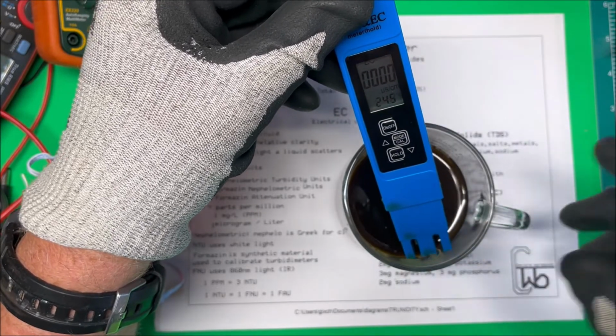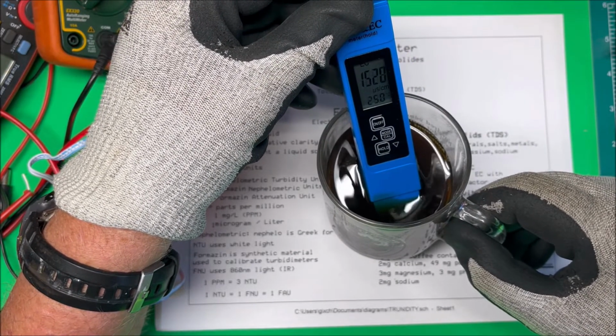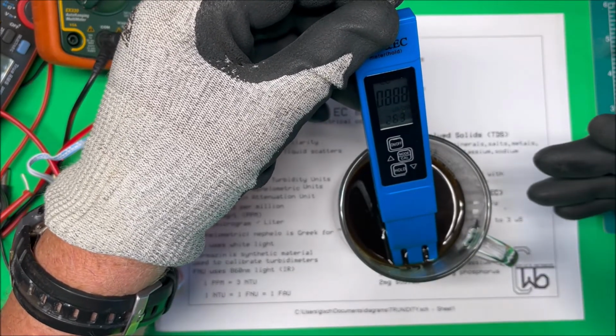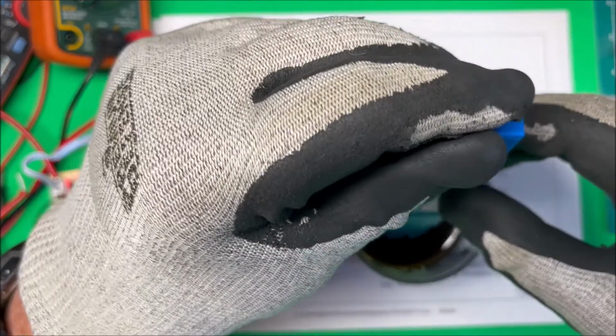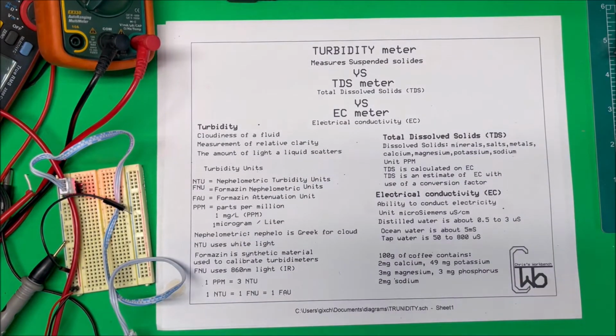And here's our microsiemens units, and that's 1500. So it'll test in the microsiemens or the parts per million. And there's just a conversion factor there. But that's how the TDS meter works.